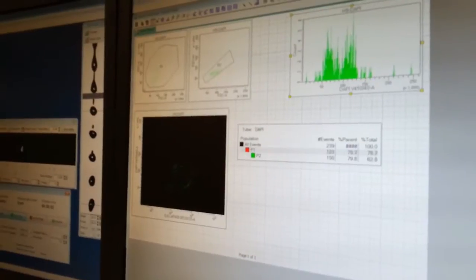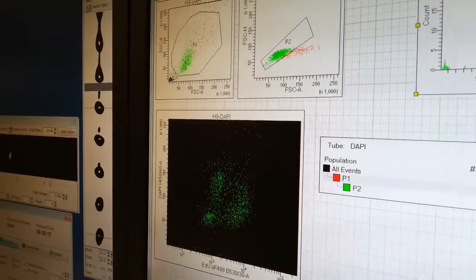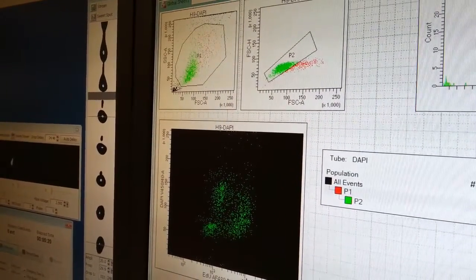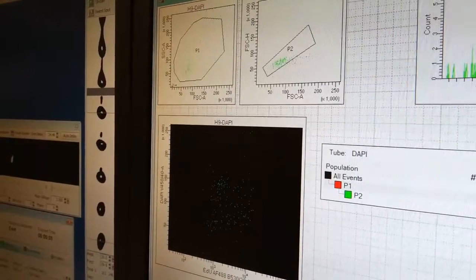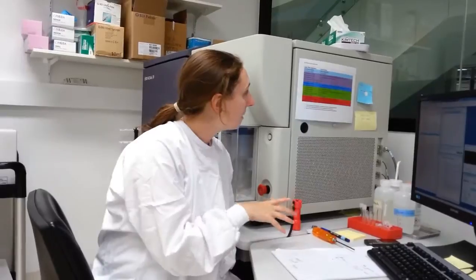So this is what the data readout looks like from the flow cytometer. Each little dot that shows up in these boxes represents a single cell. The relative position of the dots in the boxes is what gives us information. This machine has five different lasers on it that it uses to read the fluorescent labels that we put on the cells. It has a few different filters, so I can read a whole lot of different labels all at once.